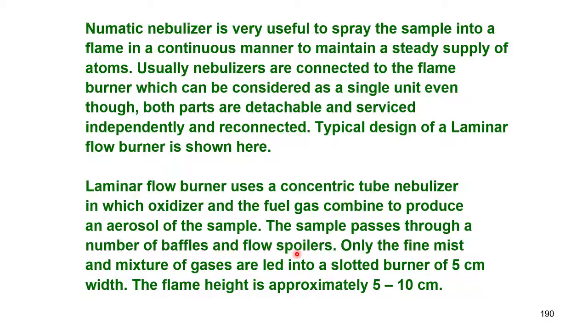You can imagine a simple plastic bottle in which liquid is put and you press it, liquid will come out, and if you put a number of small holes at the exit point, the liquid will come out in small jets, and if the hole is small enough, it will produce small droplets in the space immediately outside. That is a pneumatic nebulizer.